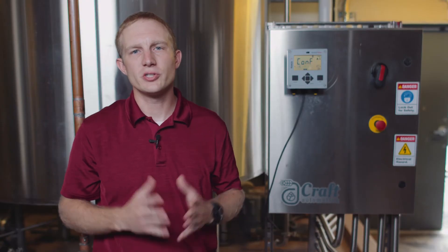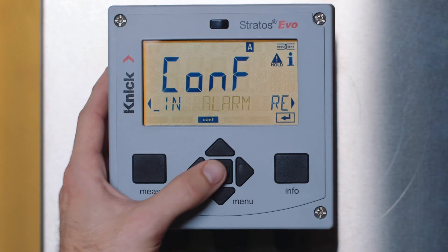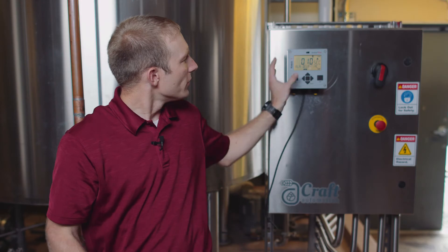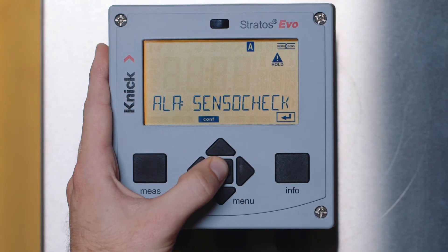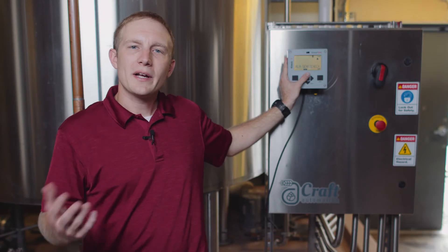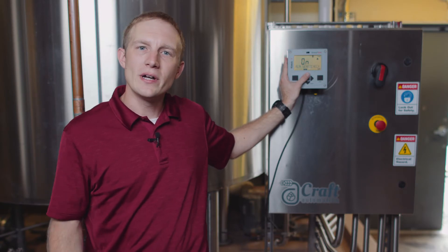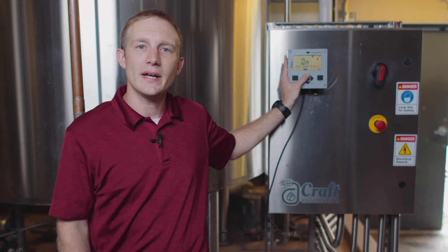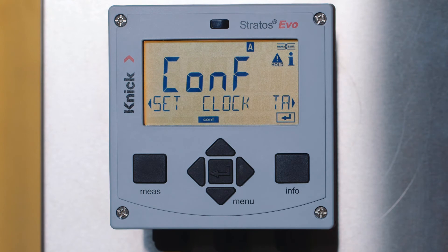Two very important menus that should always be configured are the alarm and clock menus. Let's select alarm. You will see that you can now define a delay time before the transmitter goes into an alarm mode. We will select enter for a 10 second delay. Next, you will see the SensoCheck feature. We recommend turning this feature on for more intuitive diagnostics, such as the SensoFace indicator, as well as additional icons which refer to specific errors. Lastly, the clock menu is a very important menu to configure. Doing so ensures proper information is written to the connected MemoSense sensor.